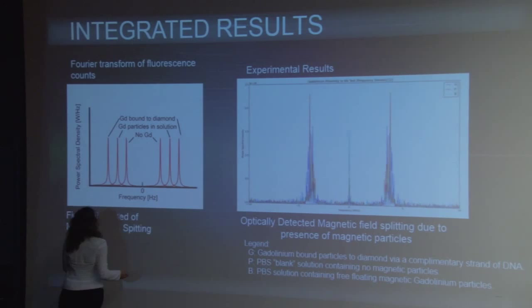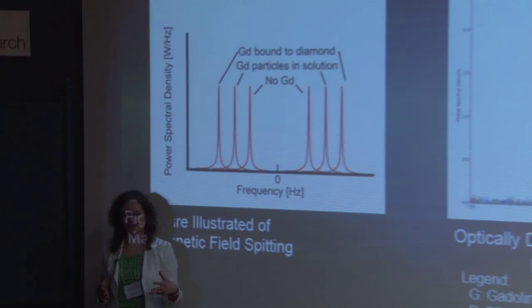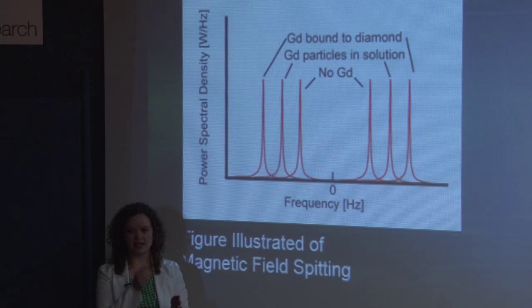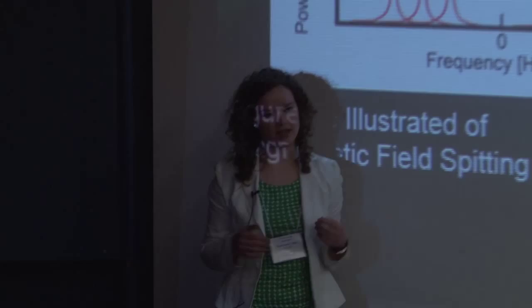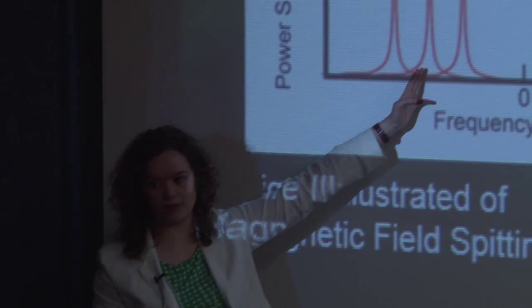All right, so essentially the two middle peaks here show the results of having just a blank water-like solution on top of our diamond with no magnetic particles at all. The second experiment that we ran was having a solution with free-floating magnetic particles. The third experiment was having the magnetic particles attached to our diamond surface via our DNA aptamer. Our results did show that as you have the magnetic particles closer to the diamond surface, you will see a bigger difference in the amount of intensity that you pick up. Furthermore, you are able to differentiate between magnetic particles close to the surface versus magnetic particles that are just free-floating in solution. So essentially, we've proven that our device is fully functional and it works.